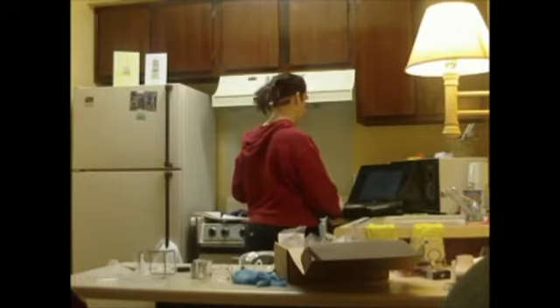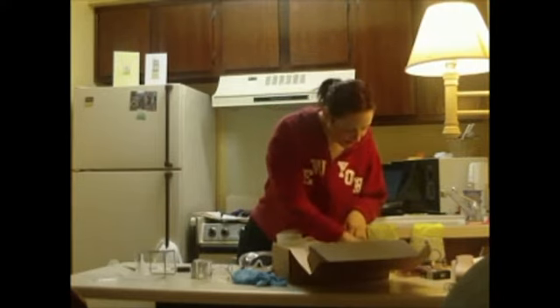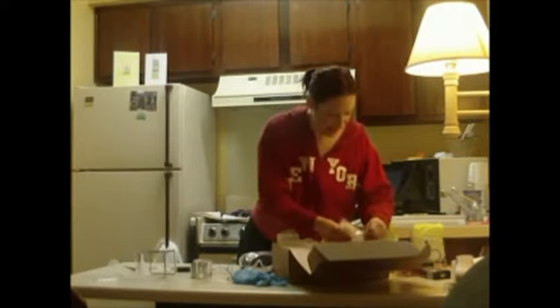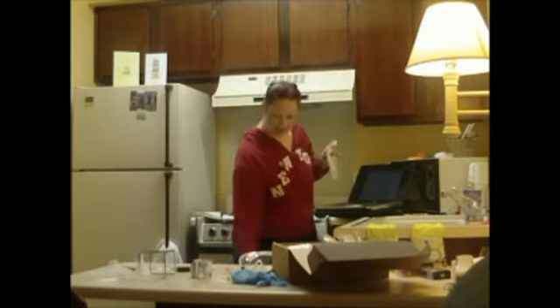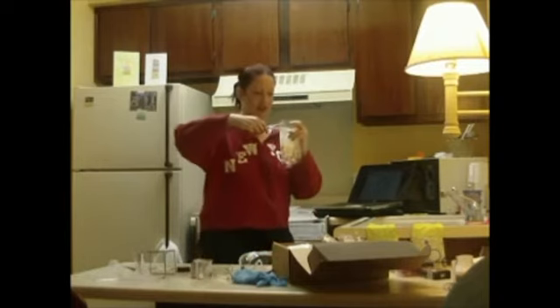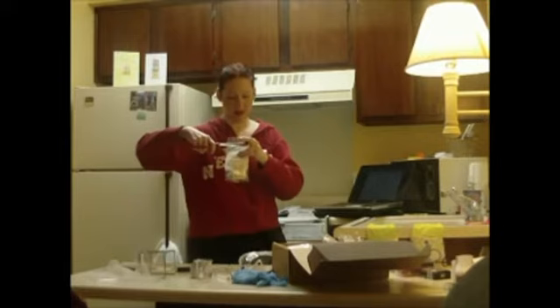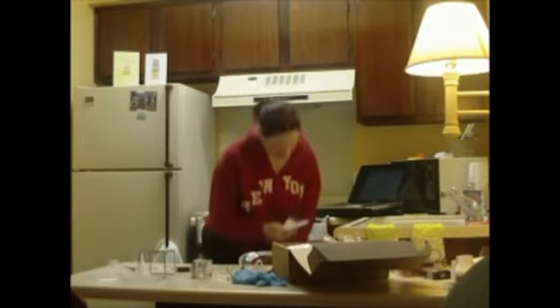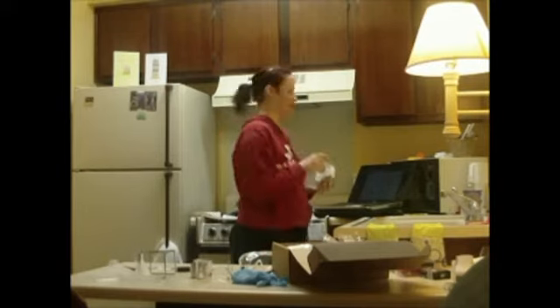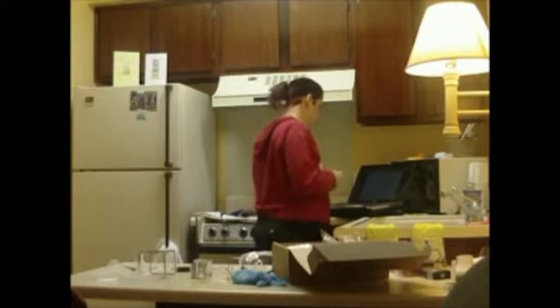Now we need from our experiment bag, physical and chemical properties. Okay, I think I see it down here. There we go. Physical and chemical properties. I have a scissors here. Make sure we have everything in here. A copper carbonate tube in a vial.